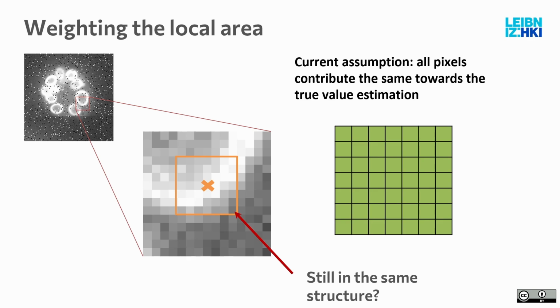And there's also another idea of what we can do. The box filter has a dumb assumption. When we take a local area to calculate the average, it makes an implicit assumption that each pixel's contributions are of the same structure.